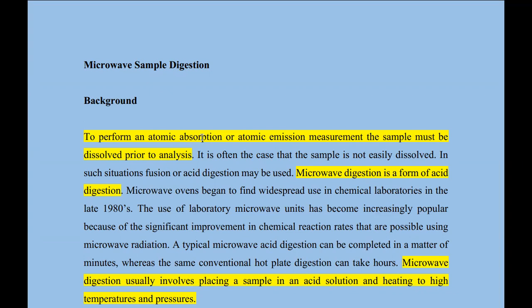You collect data from different samples. That data may be in gaseous state, in liquid state, or in solid state. Today's discussion will base much on the solid samples.